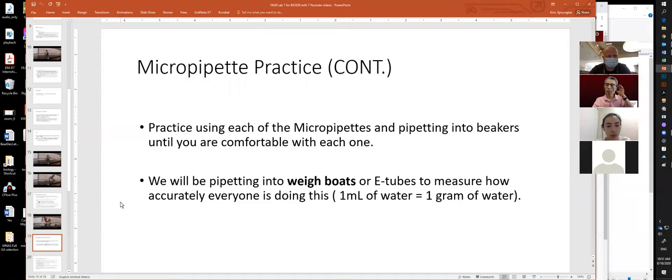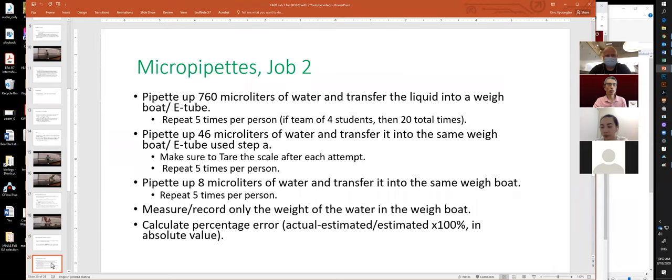So our TAs, Min and Hushrib, and myself did practice, and then we actually made a video to entertain you guys. We tried to measure the accuracy of our pipetting practices. So what we did was like this. We call it the micropipetters marathon. We had three members in our group, but if this were a real lab situation, we would have a fourth student practice this kind of thing.